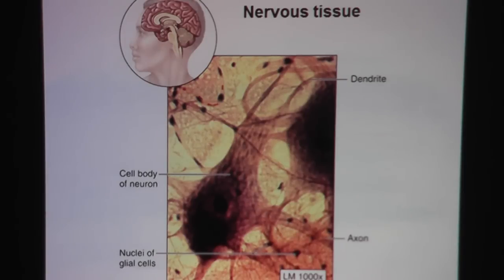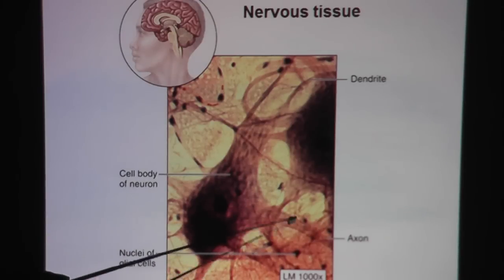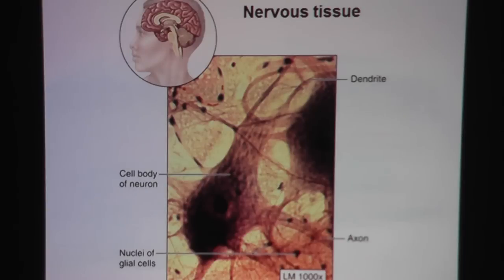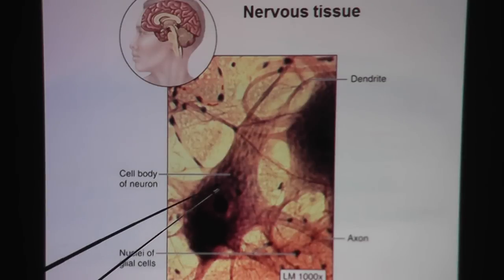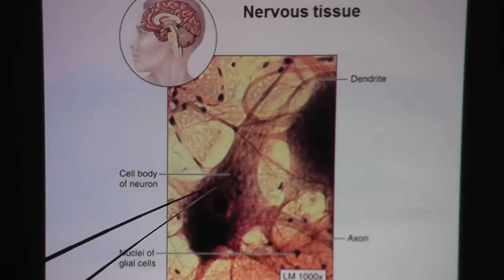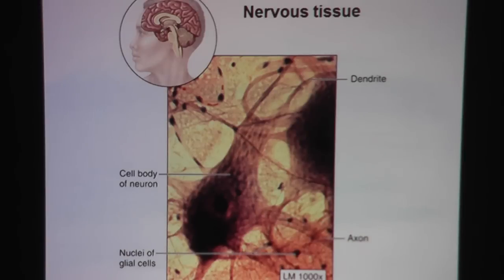I want you to see that this neuron is not the only cell in nervous tissue. If you look around, there are these little dots. Those little dots belong to cells called glial cells or neuroglial cells — same thing. Sometimes we drop the word neural because it's already implied that it's in the nervous tissue. Notice the size difference: the neuron is a lot bigger than the little glial cells. Just look at the nucleus — this is big for the neuron, and that little dot is the nucleus for the neuroglial cells.